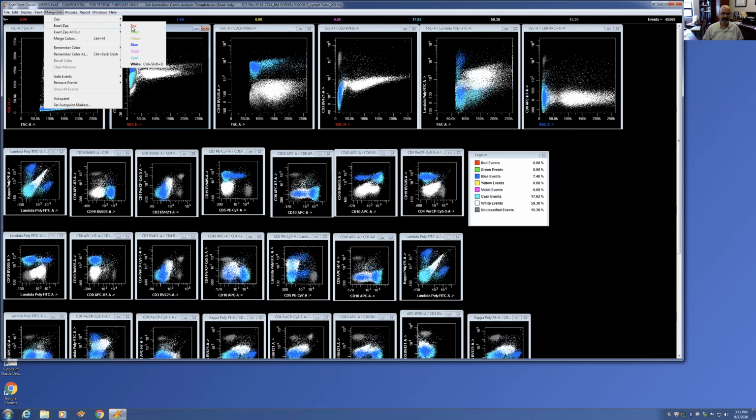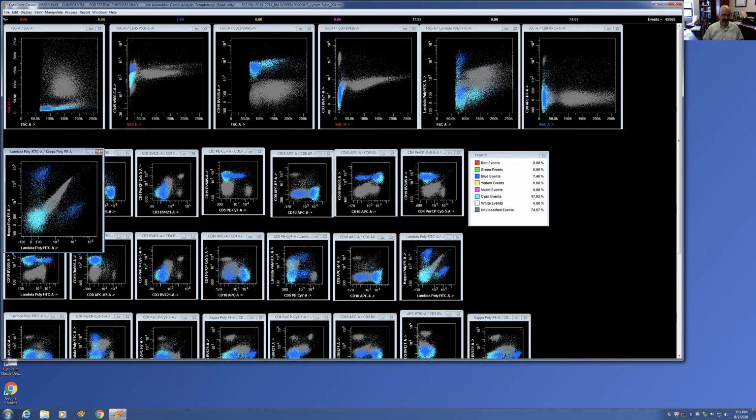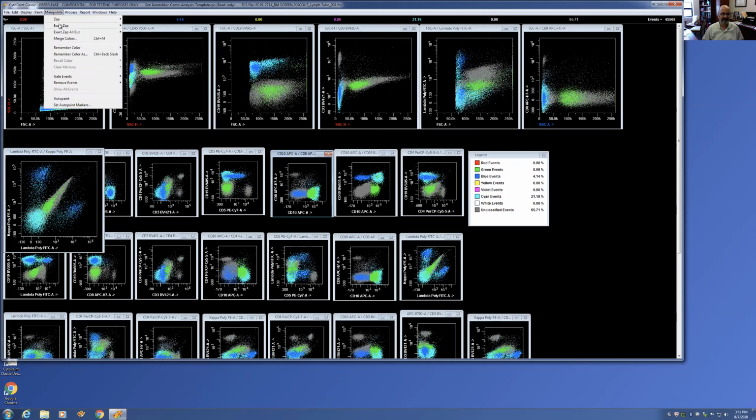I'm going to get rid of the white here. So you're focused in. All CD19 positive. And almost all of them are CD10 positive. Surface immunoglobulin predominantly negative and streaming into Kappa and Lambda. My residents here at Iowa would know exactly what this population is because it's one of my favorite cell types. Once you train at UT Southwestern, you cannot not like these cells.